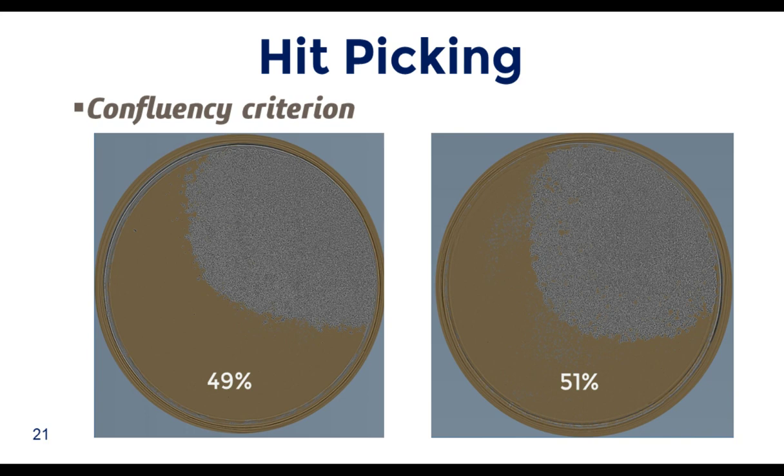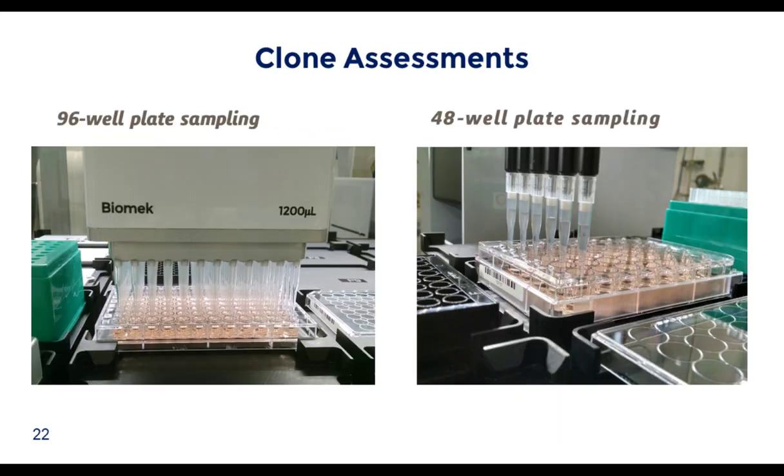Selection of clones with lower confluency equals more clones, but they will contain slower growers. Workflows will be defined on best case or typical scenarios, but we continue to evaluate. Perhaps scaling up at 20% confluence causes lagging at the next culture step due to excessive split ratio, but waiting for 80% confluence results in loss of viability.